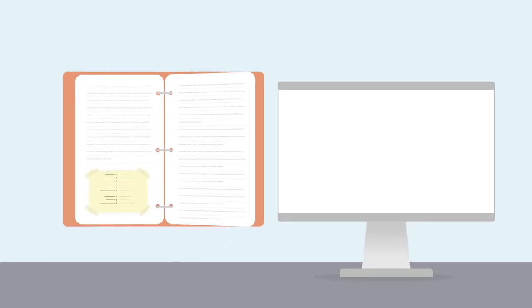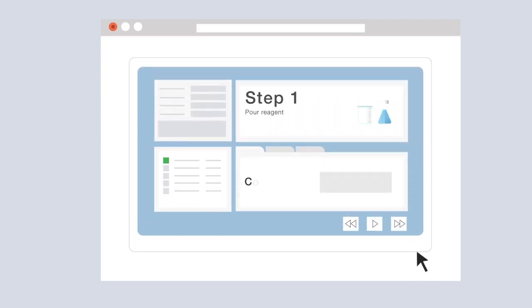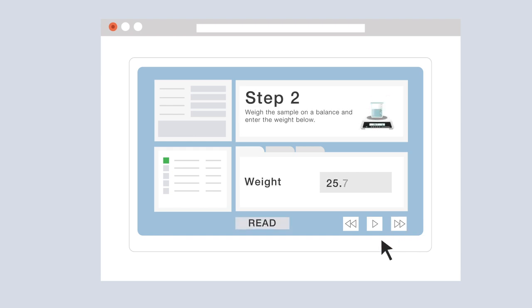Thermo Scientific SampleManager LIMS software's lab execution system is a way to replace traditional physical lab books with digital ones. It provides you with a way to digitize laboratory procedures so that you can walk your staff through complex procedural tasks step by step, checking resource availability and recording data directly to SampleManager LIMS software as you go.